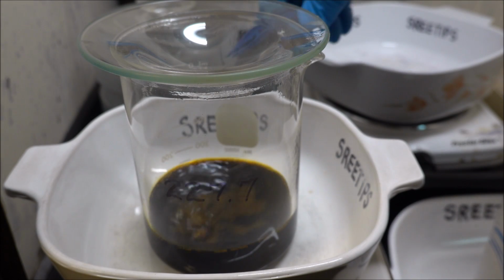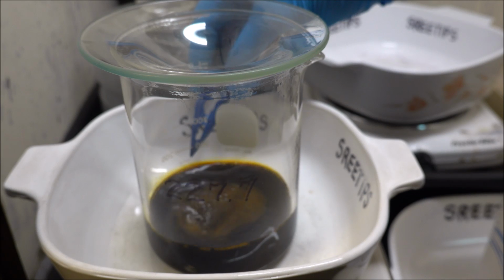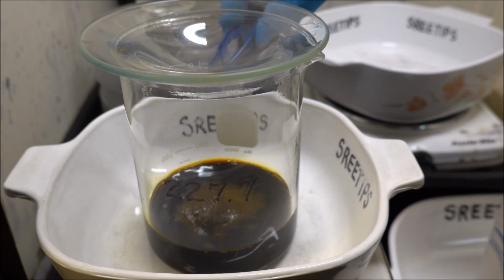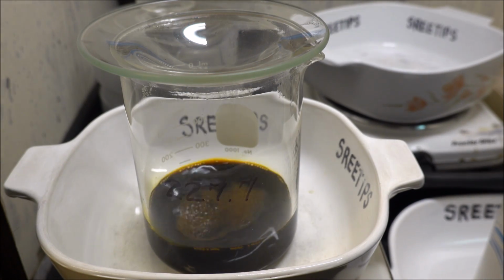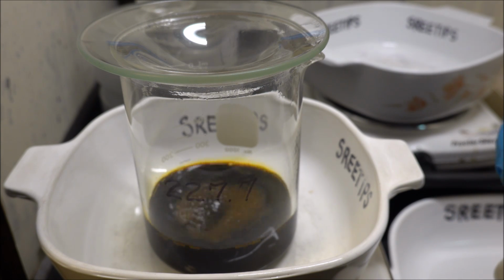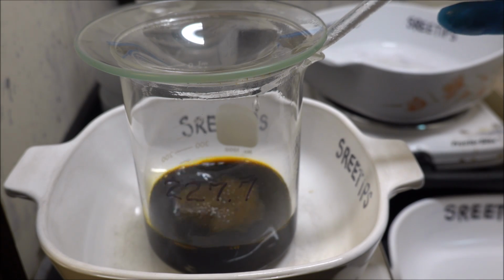Alright, I've been adding hydrogen peroxide now for about 10-15 minutes, and this line right back here on the beaker is my limit. I want to get all the metal dissolved before I get to that line so that I have the right concentration. So I'm going to keep adding some hydrogen peroxide here.